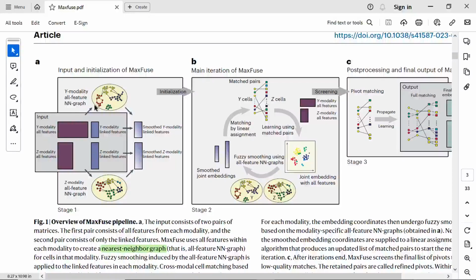We clustered the graphs for the active arrays because the active arrays contain all the features. So the graphs in the active arrays will give the best clustering. So now we can use the information in the active arrays to refine the graphs for the shared arrays because the gene names come from the active arrays.